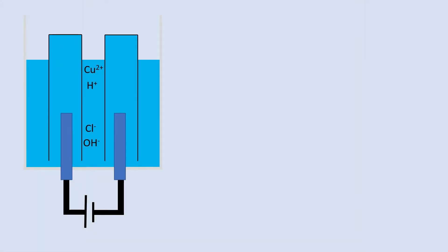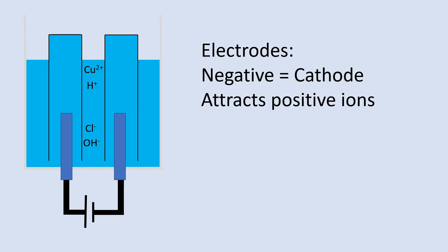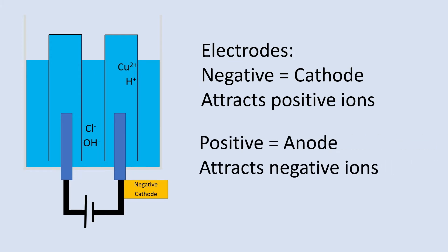Now we have the electrolysis running. We have two electrodes: the negative electrode called the cathode, which attracts the positive ions — we can see that happening here — and the positive electrode called the anode, which attracts the negative ions, and we can see them moving here.